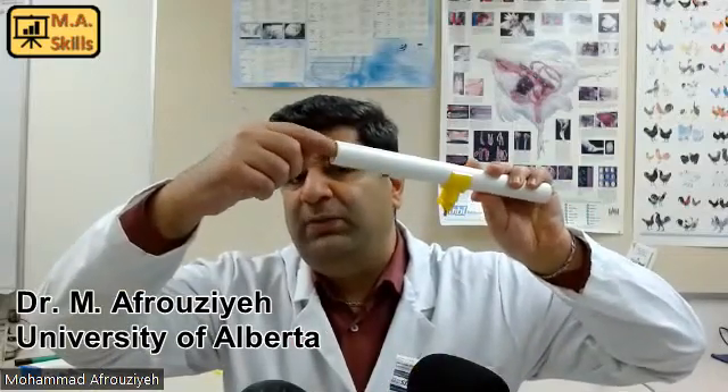If you are going to have your water analyzed for a mineral test as well, you need to collect more water — maybe half of the sampling bag. However, never rely solely on the results of drip samples, because with a drip sample you are only looking at the water coming out of that drinker line. You don't really know what's going on inside the water line or what kind of biofilm is attached to the wall of your drinker line. That's why the better sampling method is swab samples.